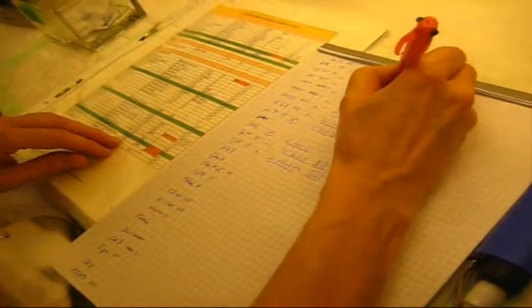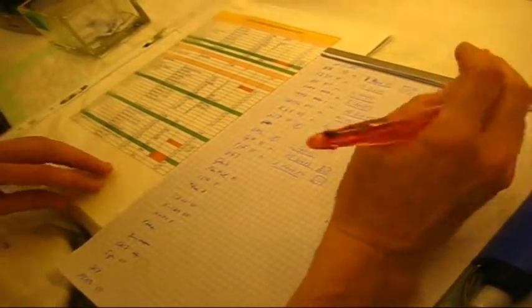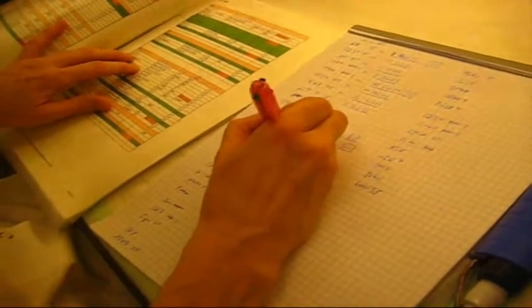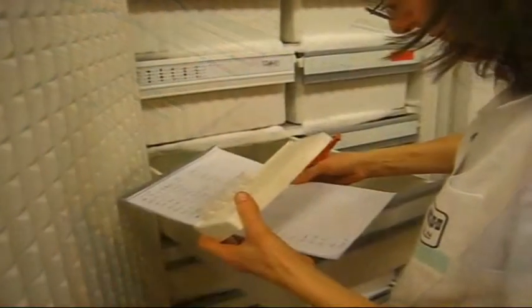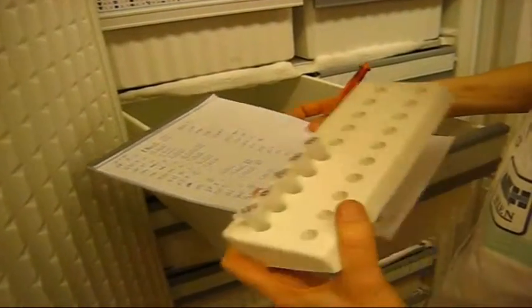Сейчас записываются концентрации разведения антител для тех антигенов, которые будут подвергнуты сегодня исследованию. Концентрации они подбирают сами, наиболее оптимальные. Некоторые из антител предварительно уже были разведены и хранились при минус 20.